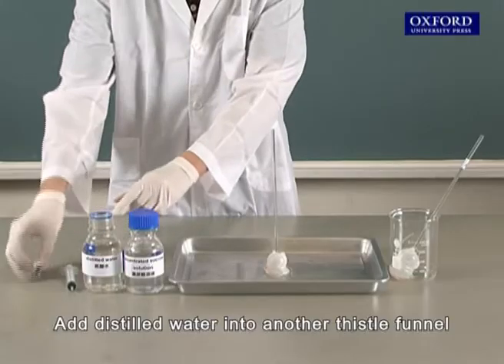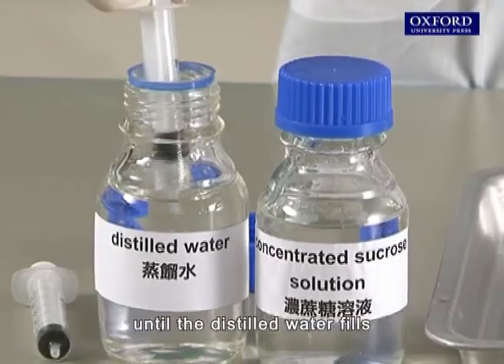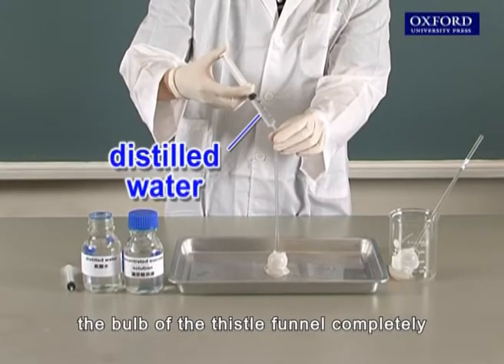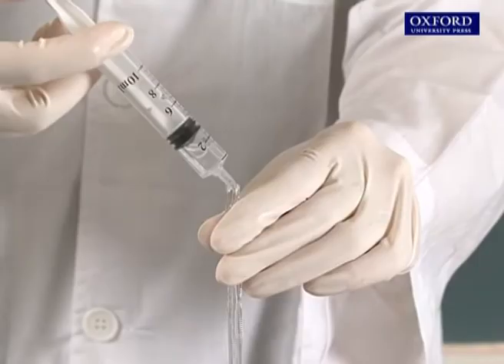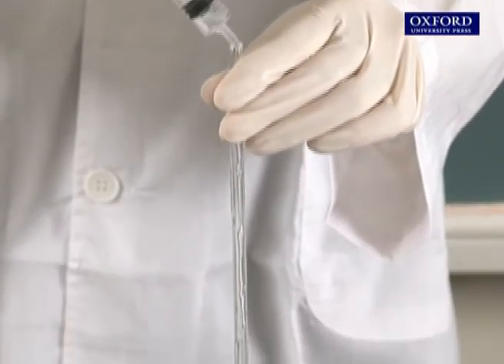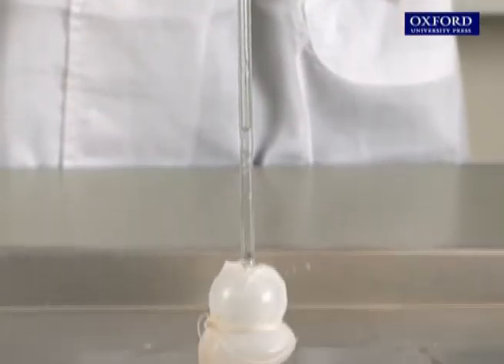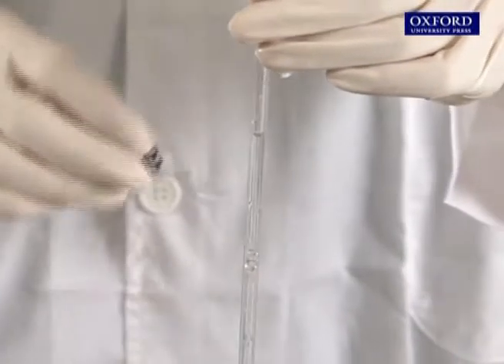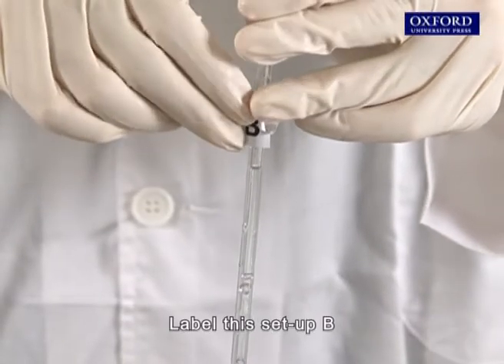Add distilled water into another thistle funnel until the distilled water fills the bulb of the thistle funnel completely. Label this setup B.